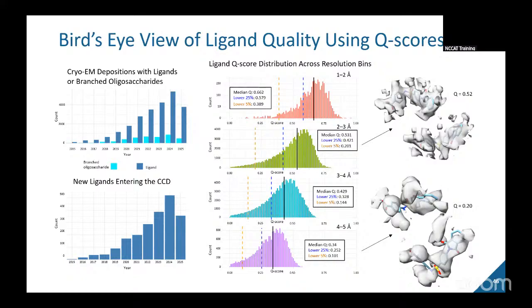But there are other cases. It's like the difference between, let's say, a bad Q score for a residue because a phenylalanine was placed over here and the side chain density is over there, right? That's different from a bad Q score because there just wasn't any side chain density, or the resolution was too poor, so you don't get any correlation between the atomic model and the map. It's really hard to answer that question because right now the Q scores are mostly being calculated for the backbone. I haven't looked at it as much until we very recently got into this, trying to look more into atoms and side chains and analyzing them, which is quite useful. It's not used as much these days.